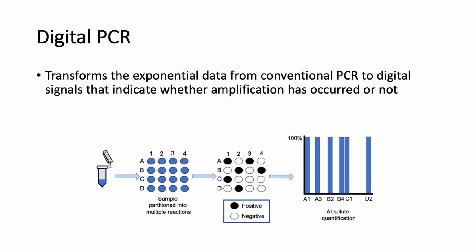Digital PCR is accomplished by capturing or isolating each individual nucleic acid molecule present in a sample within many chambers, zones, or regions that are able to localize and concentrate the amplification product to detectable levels. After PCR quantification, a count of the areas containing PCR product is a direct measure of the absolute quantity of nucleic acid in the sample.